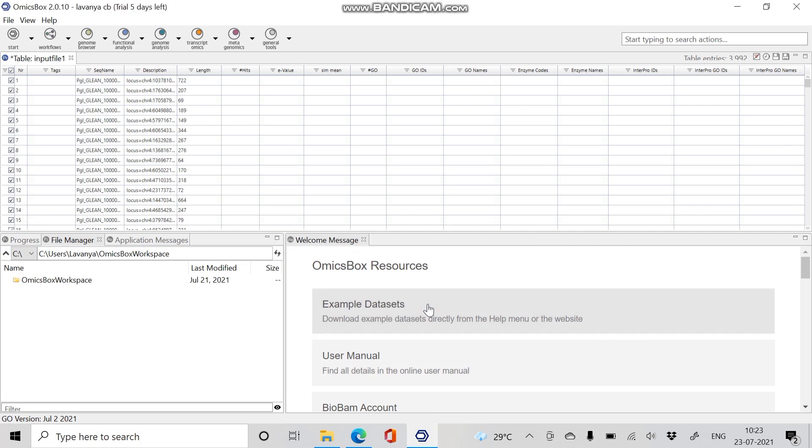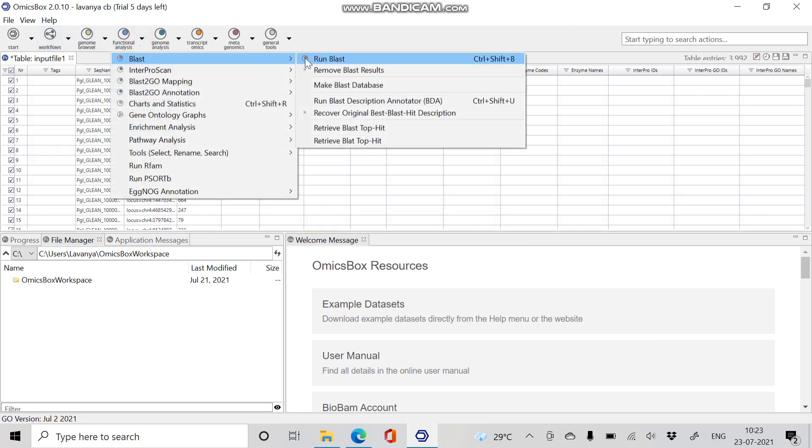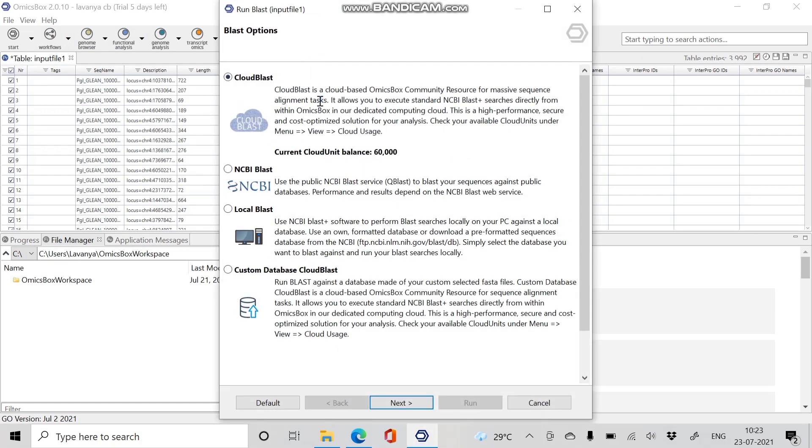Now we have to proceed with BLAST. Click on Functional Analysis, go to BLAST, and click Run BLAST. In the BLAST options, we have to select the database to proceed BLAST. Cloud BLAST is high performance, secure, and cost-optimized solution, independent from NCBI servers to provide fast and reliable sequence alignment.